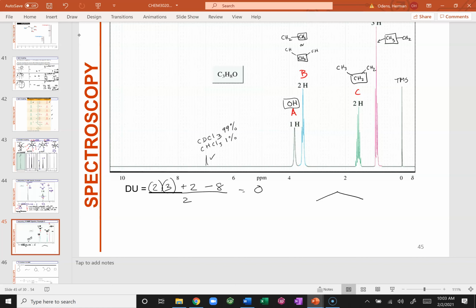So, according to this pattern, notice that that OH needs to be at the end of the chain. But let the carbon speak to you. So, here we go. Notice that the signal C says it all. C, you have a CH3, a CH2, and a CH2. That is the best pattern that you can have. And those are just your 3 carbons right there. So your OH is meant to be here. All right?